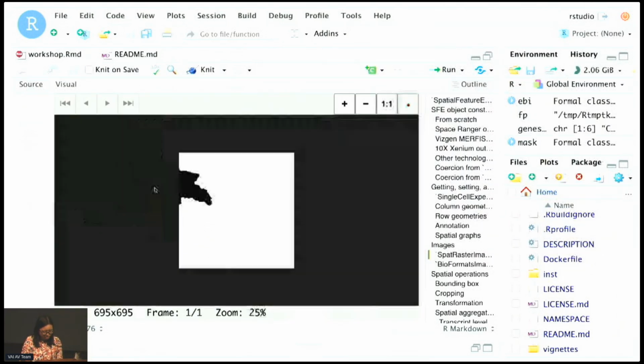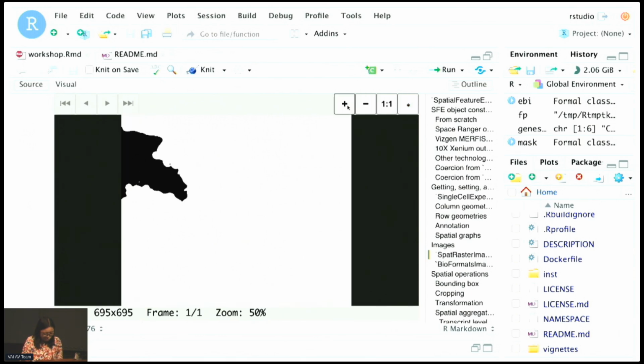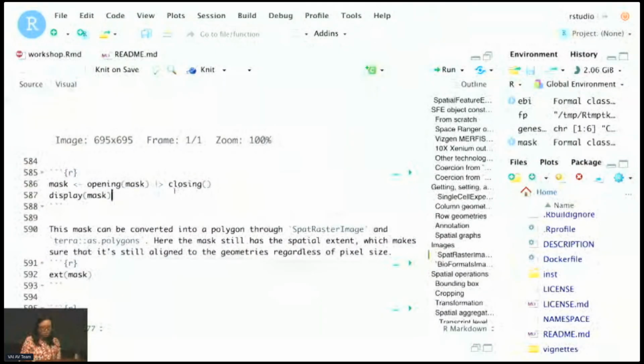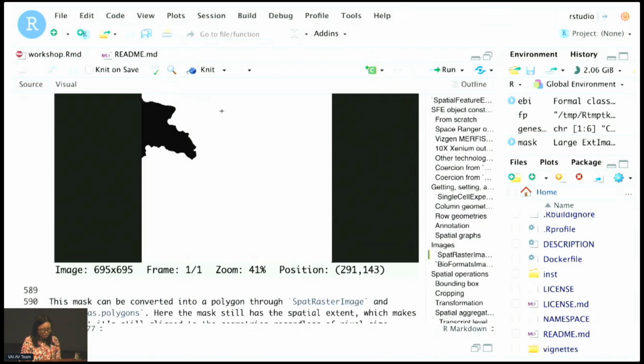And we see here that there's a small bit and there's a hole, and from the image processing tradition, we can do an opening operation; opening can remove the small bits and closing can fill in the holes. That's what it would look like.